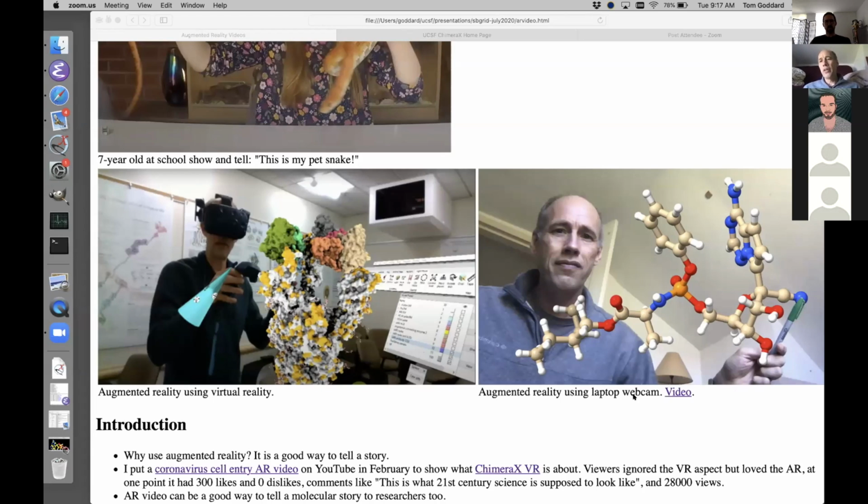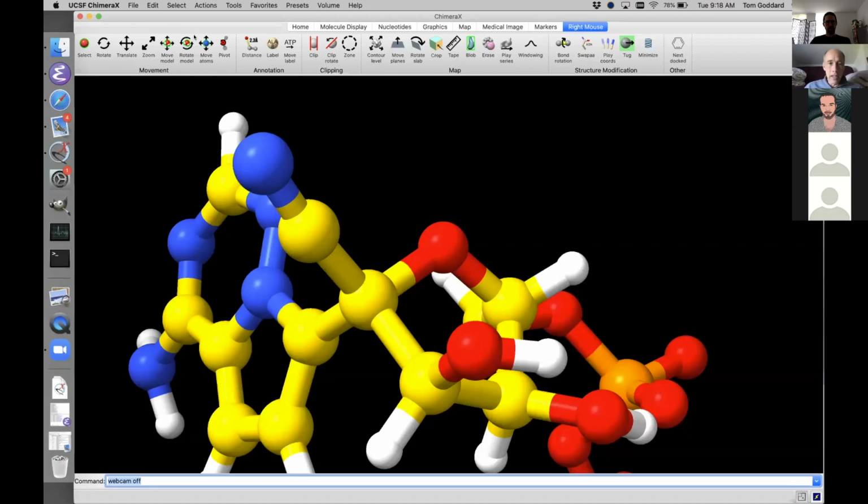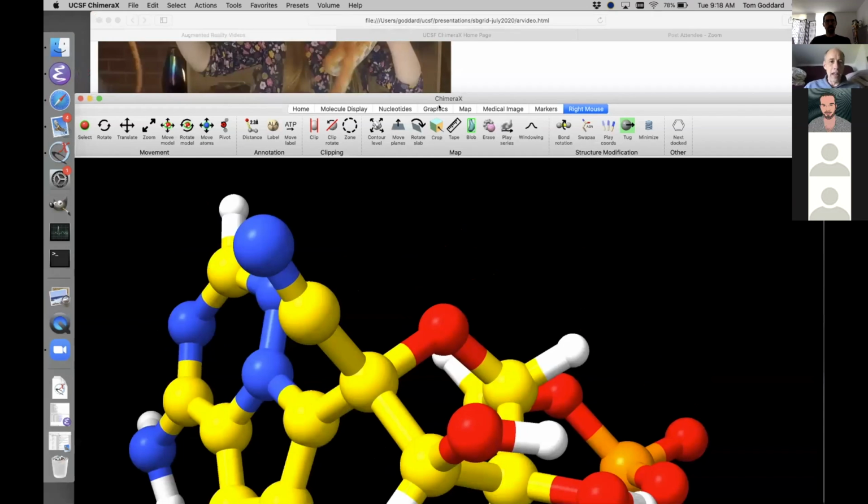A lot of what you can do in ChimeraX is with just button clicks. Like it has toolbars along the top, let's see if I show you that. It has these toolbars that have a ton of icons that do all kinds of things. And it has a lot of mouse modes, and all of those can be used in VR. So there are many things you can do, but not having the keyboard is still a big issue.